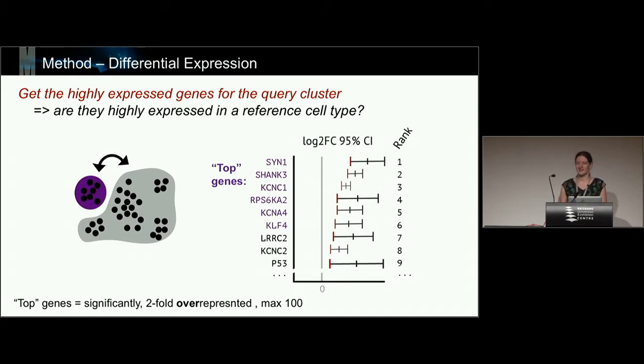But this being biology, you can't just pick two gene lists and overlap them in a big Venn diagram and expect to get anything useful out of it, because it's never that clean. So hence we use the differential expression. We take a sort of full gene set ranking approach, where we calculate the relative difference of each gene's expression.